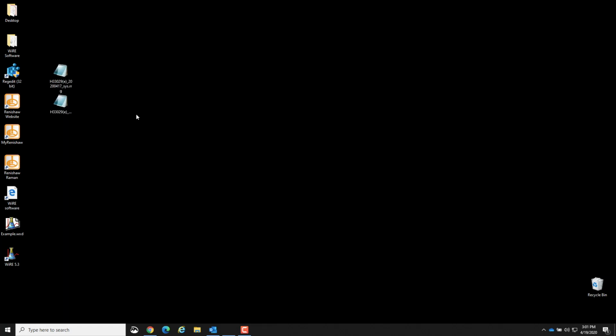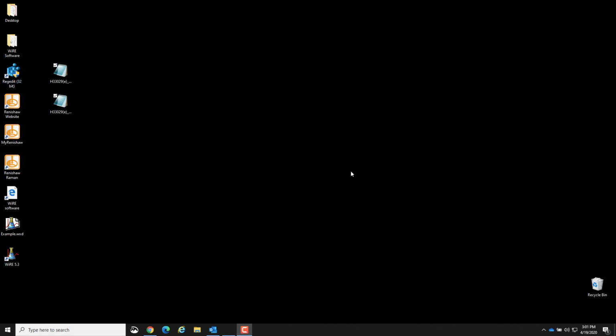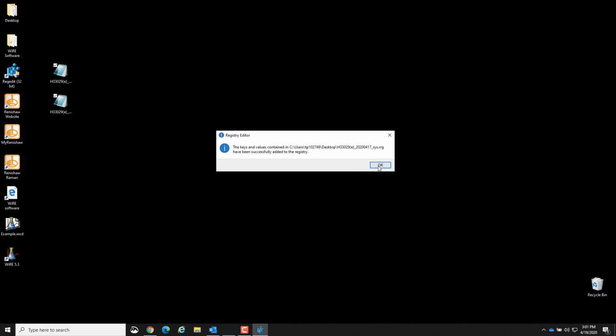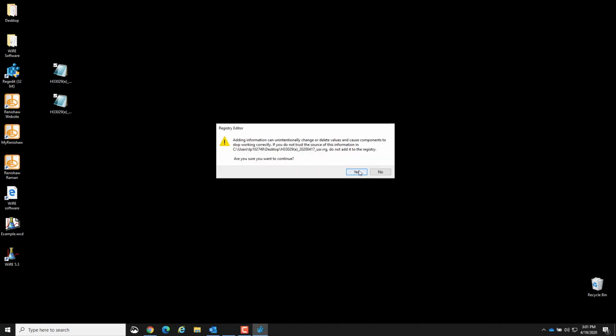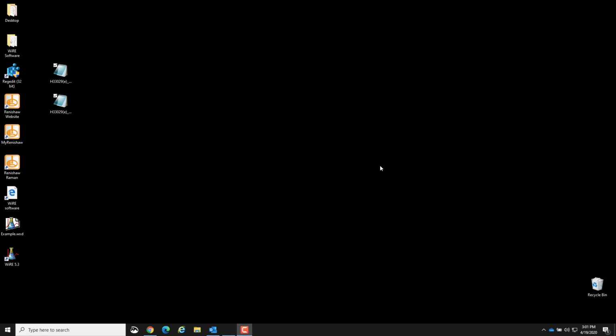If you're running WiRE 3 or 4 and you have an RRG or reg files, simply drop those onto the regedit shortcut that WiRE placed on your desktop to copy the configuration of your instrument to the new installation. You will still need to enter the passwords for your installation when you launch WiRE for the first time.